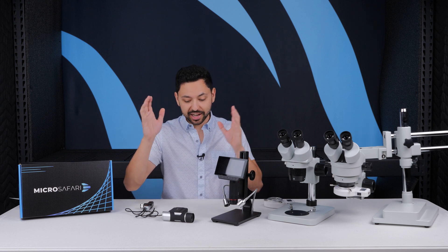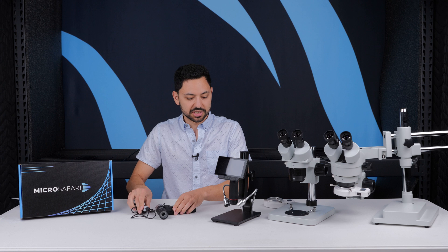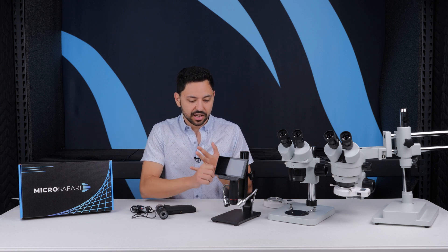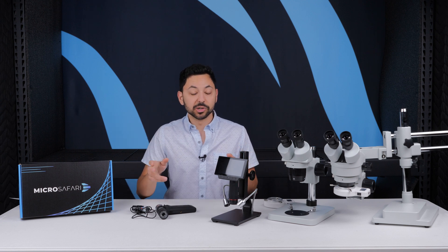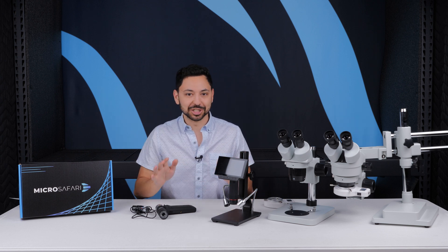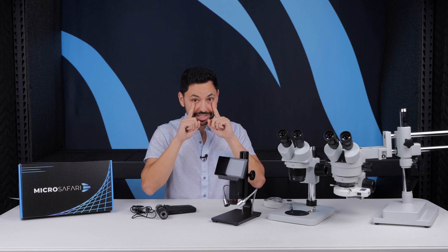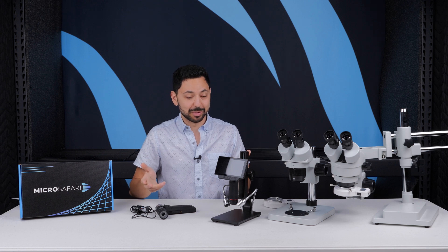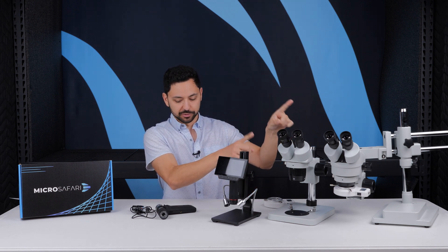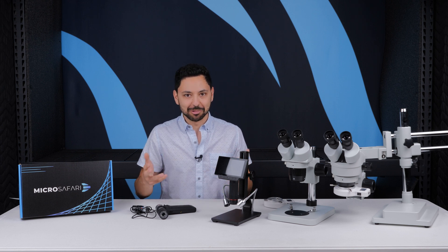Next, onto the digital microscopes. We have a couple of different kinds: the Anonstar portable microscope, and also another Anonstar that's just a static unit on a stand. Your kids are going to be using these to look at surface textures, find insects to look at, skin, and other things like that. The really important detail is that digital microscopes are just really easy to use—the fact that you have a screen to look at makes things so much easier. When you have to physically look through eyepieces, you need proper optical alignment between your eyes and the eyepieces. I've found that kids struggle with different eyepiece sets. As a general rule of thumb, screens are going to be so much easier for people who aren't quite as capable as adults.